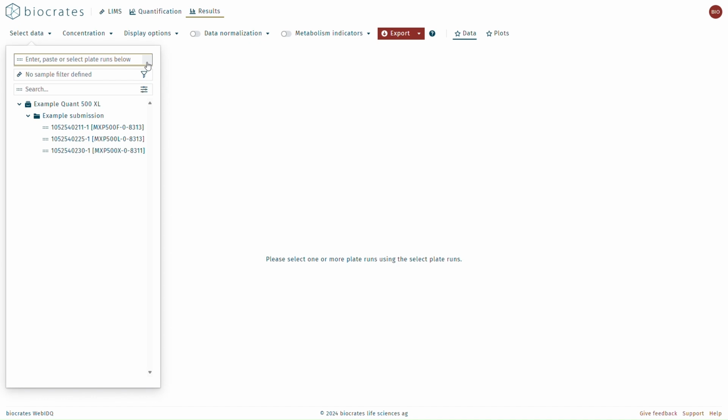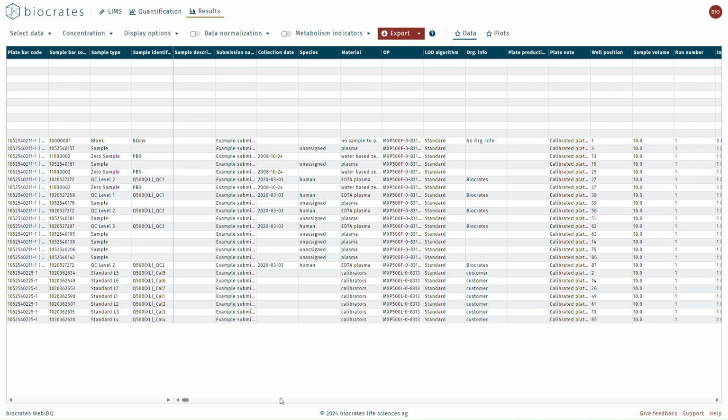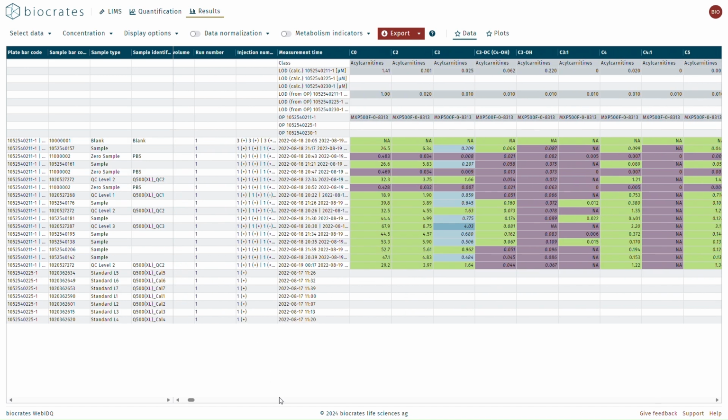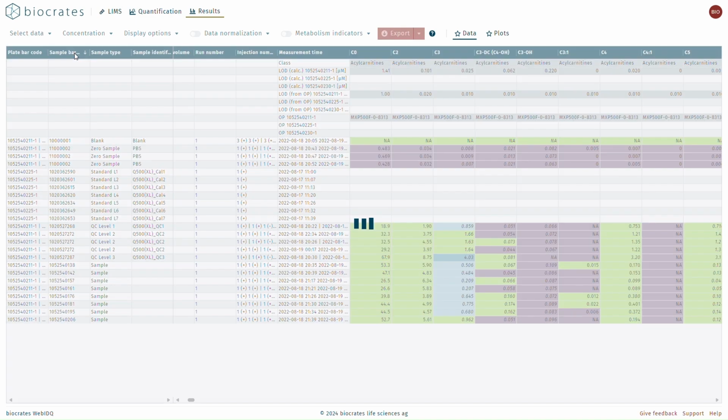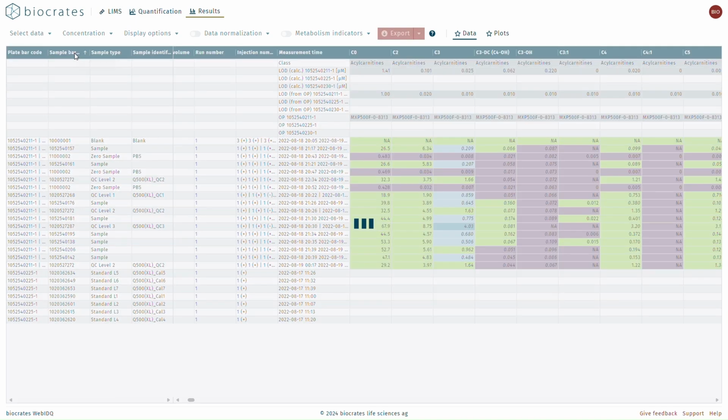After selecting and loading sample data, the results table below gives a preview of what the data will look like after exporting. The table can be sorted by clicking on any of the headers. Clicking again will reverse the order, and a third click will disable the sorting. Extra levels of sorting can be applied by control-clicking on additional headers.